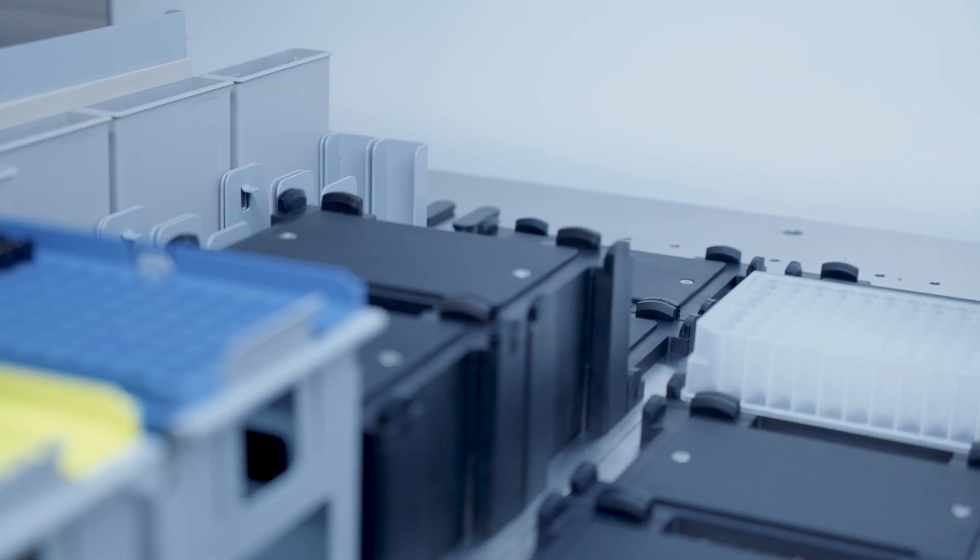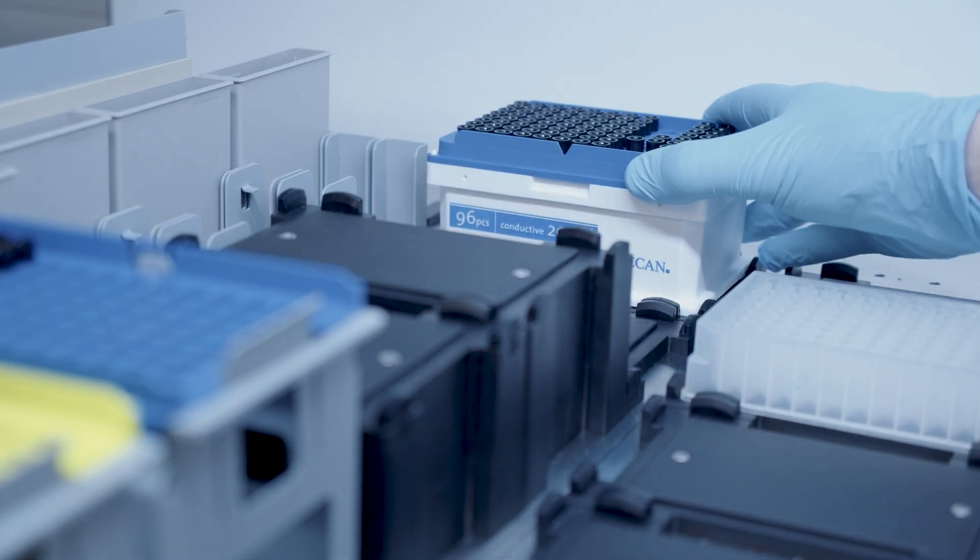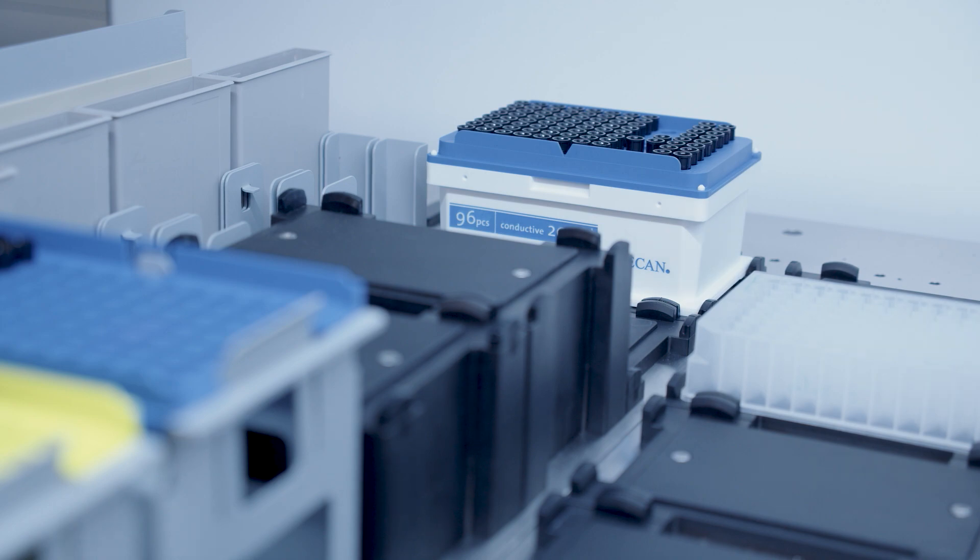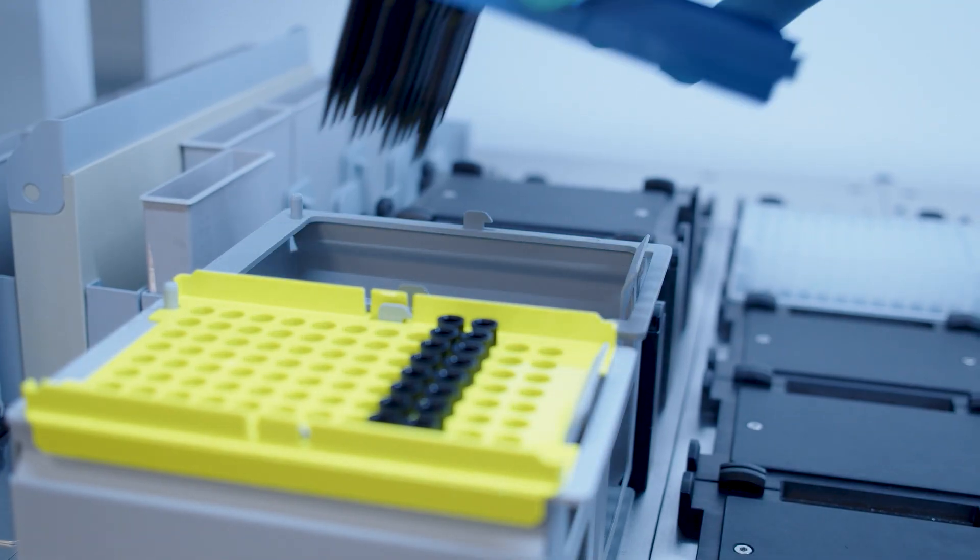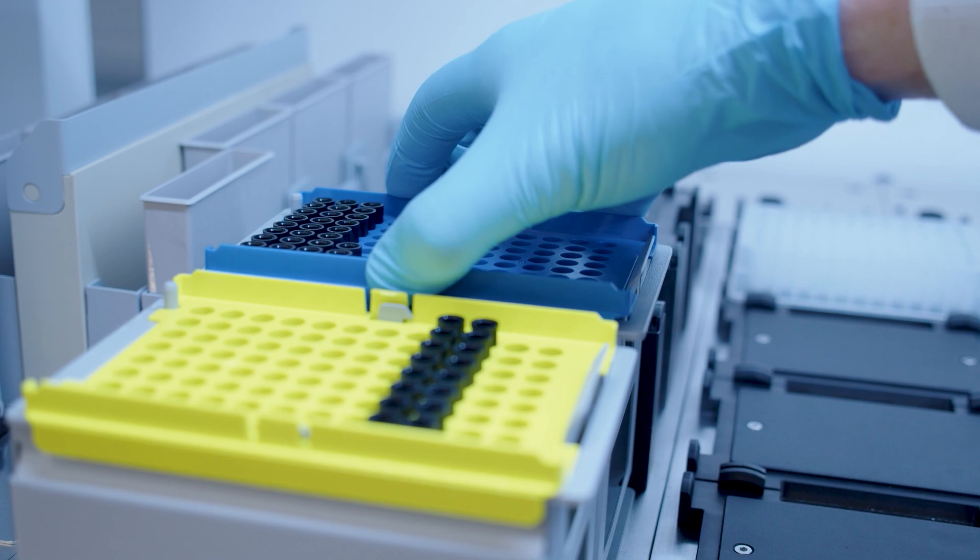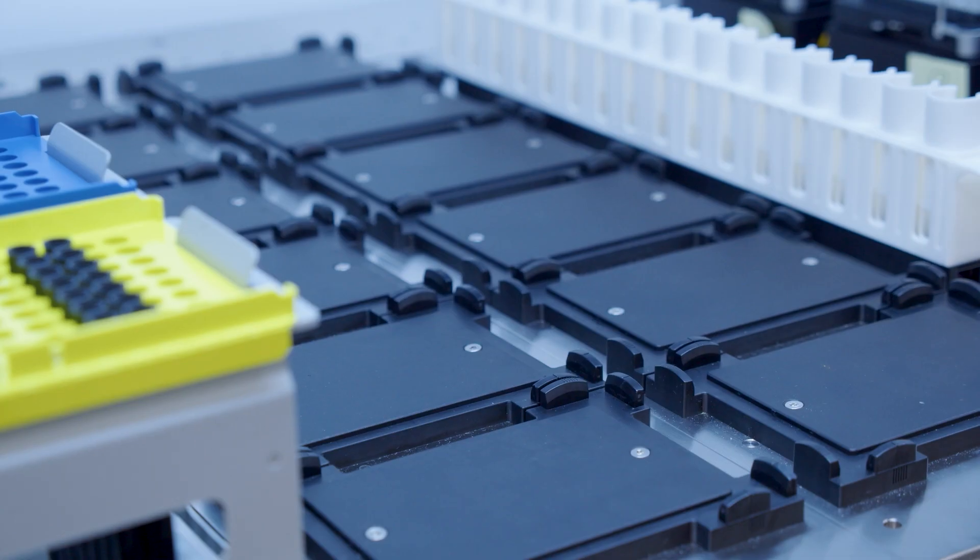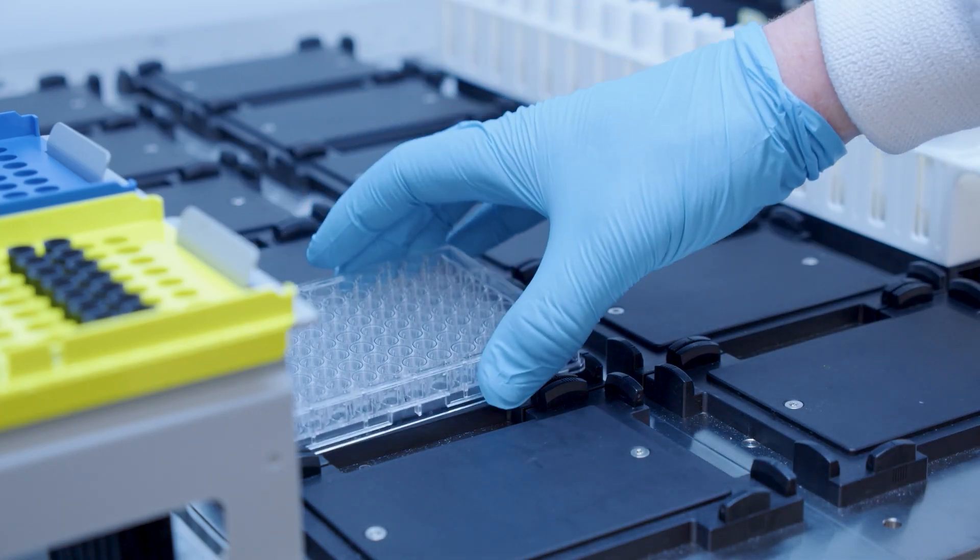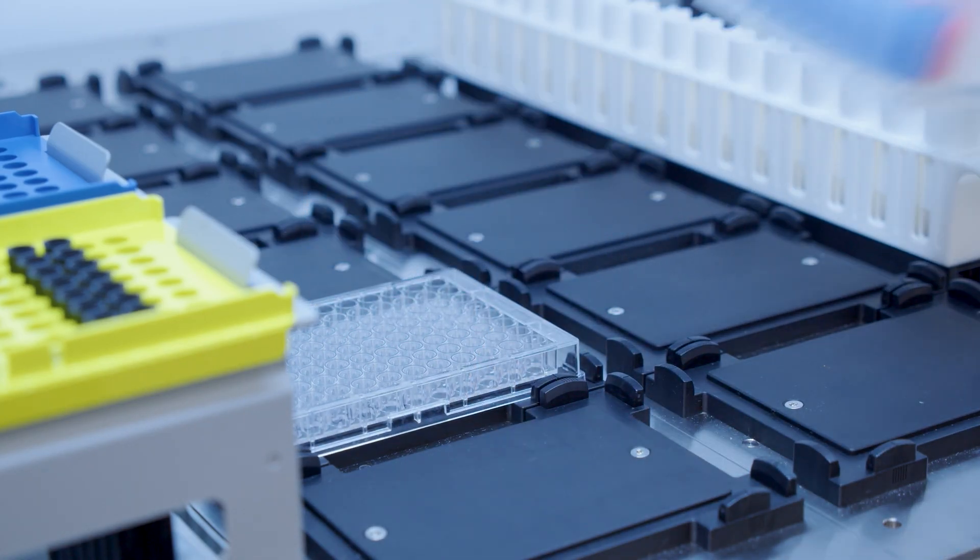If your device uses disposable tips simply load them to the positions you specified whether that's the individual carriers or the built-in tip racks. Then load your output plate and input liquids.